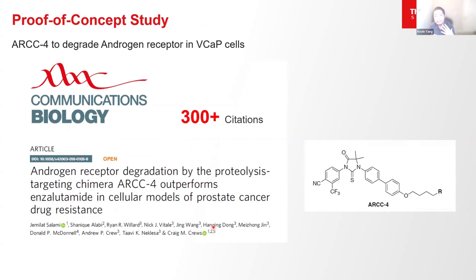So to drive those kinds of studies, the discovery of PROTAC compounds or other protein degraders, mass spec is really important because most of the time we need to do a screening of those compounds. We're talking about thousands of compounds to screen, and we want to know which compounds are the right lead. How do we achieve that? How do we screen those compounds from mass spec?